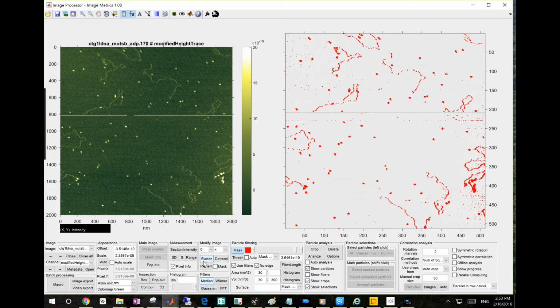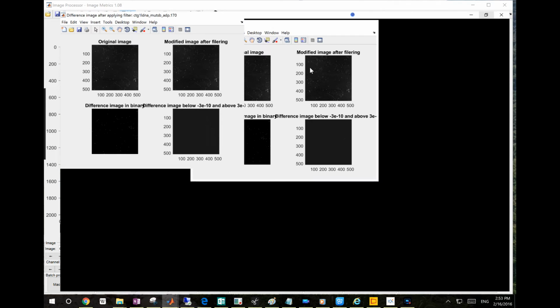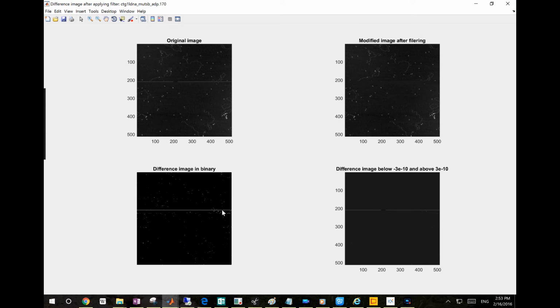So you can use mask flattening, as I showed you before. You can just use the median filter again. This time, still use the whole image. The lines are included, so you can change this, just fixing that line. For example, let's say 2, maybe, yeah, 2 is fine.